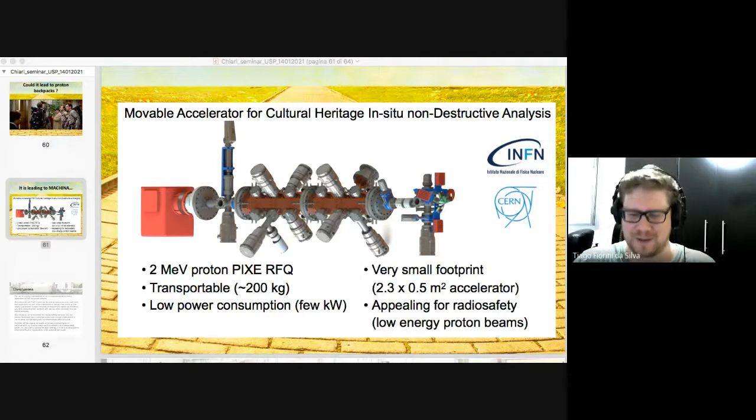Okay, just to finish all the questions, I have one concerning the future. I see that in your laboratory you are constructing a new setup for irradiation. You are working with pulsed beams for implantation. You have this idea of a portable accelerator, but in the sense of the whole field of IBA, do you see a future for this? What are the trends that you see? Because I see that you and your facility is highly connected with the future. That's my question.